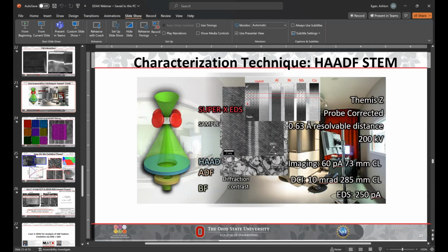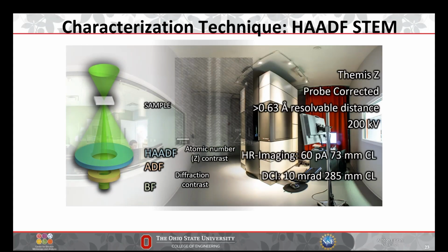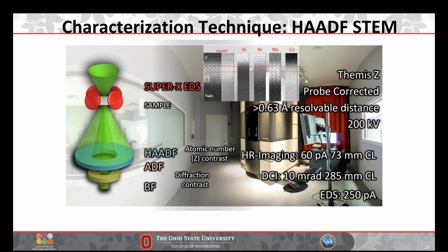Yeah, so this is a good slide to show why it's important. There's a couple of factors at play here. You can see in this little schematic, there's a sample, and it's surrounded by 4 EDS detectors. There's a variety of different architectures for doing EDS in TEM. If the sample is not exactly flat, so let's say I tilt it towards one detector, I'm talking about the Super X detectors, you would then shadow the detector from the opposite side.